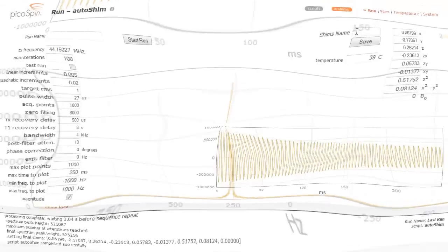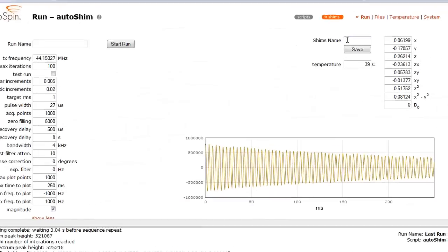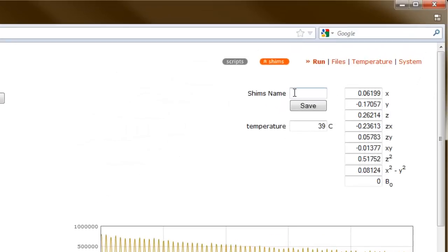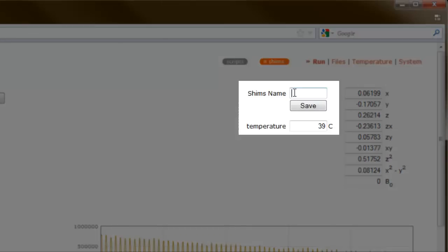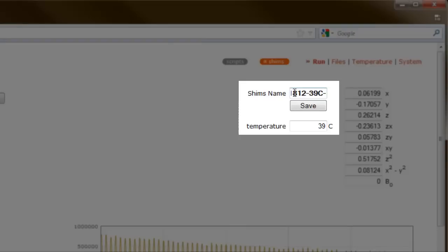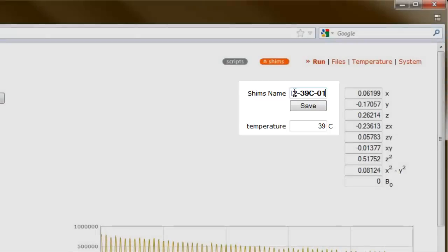Let's finish our shimming procedure by saving our shim values to a file. If we click the abort run button, or the auto shim script has run to completion, the shim's user interface will appear. This user interface will not appear unless there is an improvement in the shim currents. Let's navigate to the shim name field and provide a file name that is descriptive of our shim. I like to use my initials, date, magnet temperature, and serial value in case I want to save other shim files today.